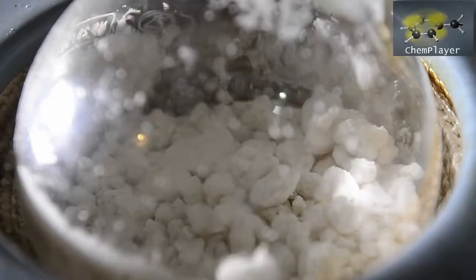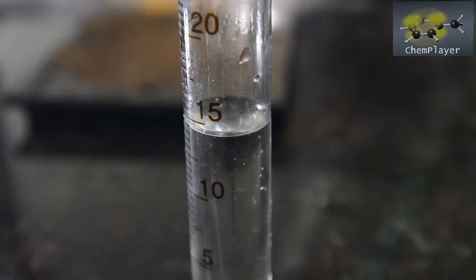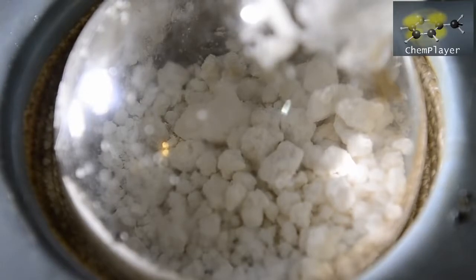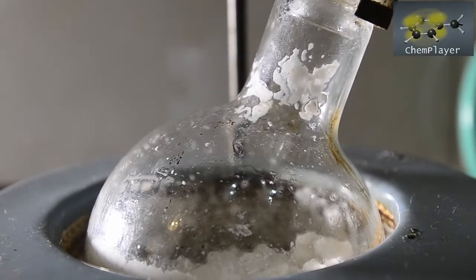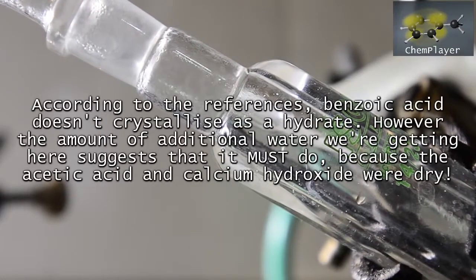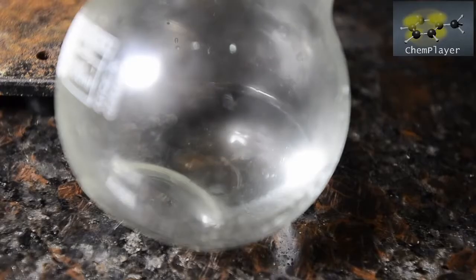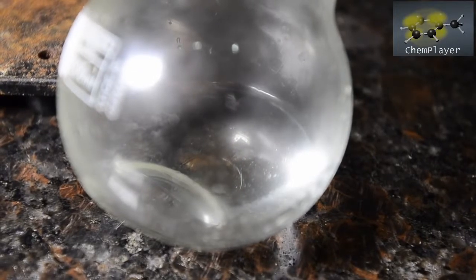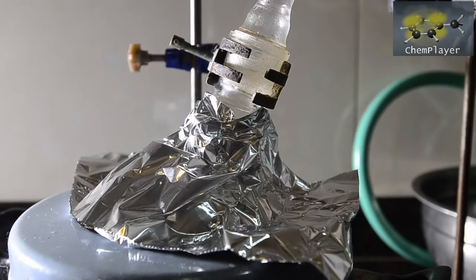We keep heating for about 30 minutes, and after this point we've got about 15 ml of water distilled off. So as before, at this point we increase the heat and start to blast the calcium salts in the flask. We've got more water condensing, so it's possible our benzoic acid has a bit of water in it. But soon we've got what appears to be a pale yellow-colored bubble of immiscible liquid forming. We insulate the flask so we can get the temperature as high as we can.